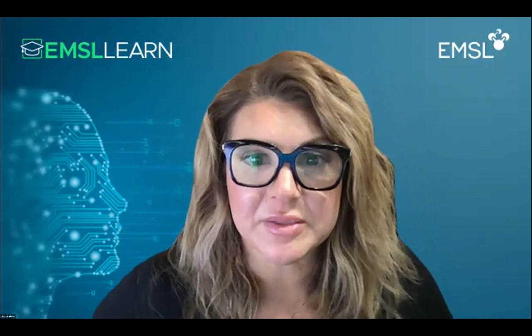Can you talk a little bit more about the advantages of NanoLive over standard confocal microscopy? The major advantage is parallel sample and data collection. So you can look at multiple replicates or parallel strains or sample conditions, and it's designed very specifically for time lapse over long periods of time with low phototoxicity. Those are the major reasons that you would want to use the NanoLive.